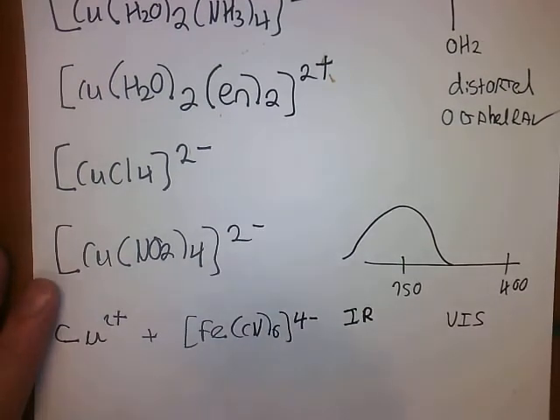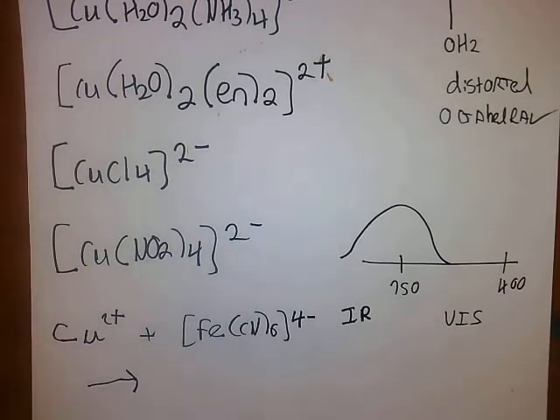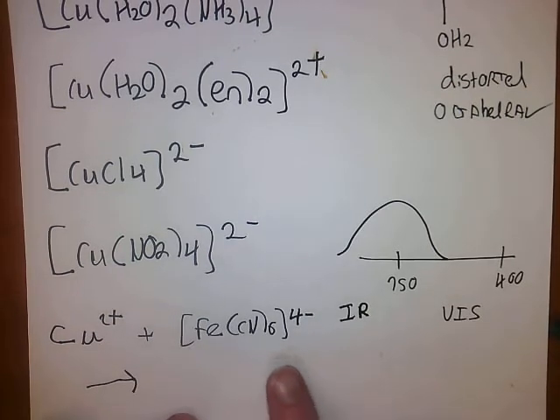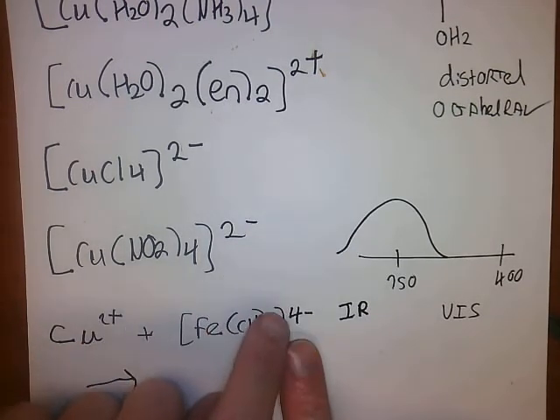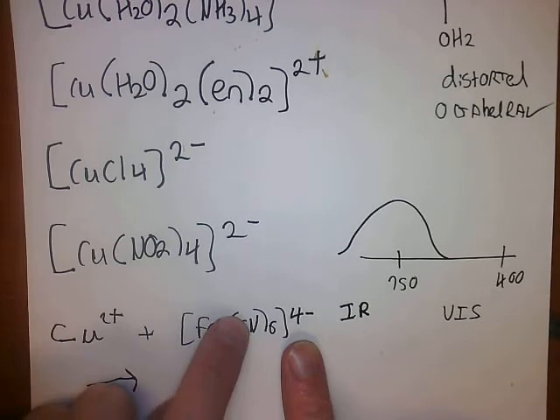So once again, it's producing a precipitate, like the iron 3 and the ferrocyanide did. Because we're producing a precipitate, our formula has to be neutral. It can't be charged. So the question becomes, how do we get a compound between a +2 cation and a 4- anion? The way you do that is you have 2 of these for every one of those, right?